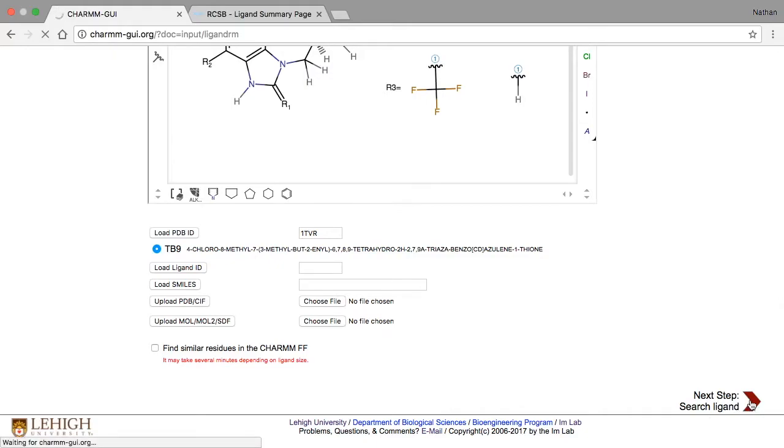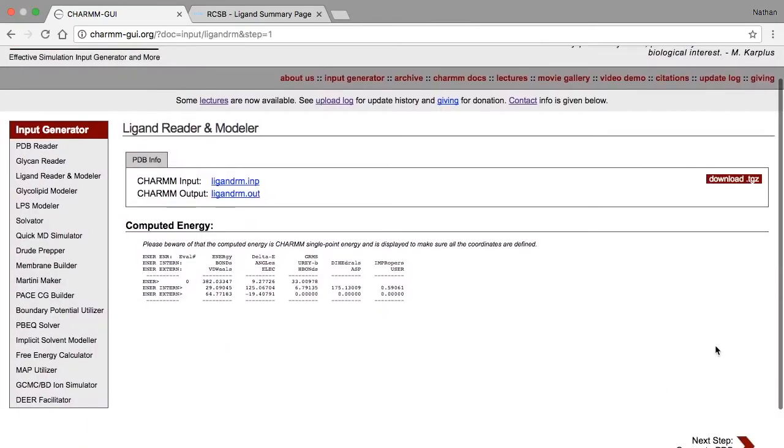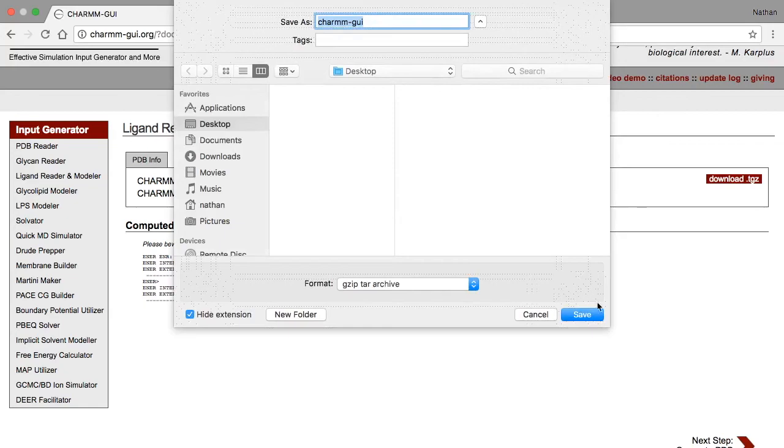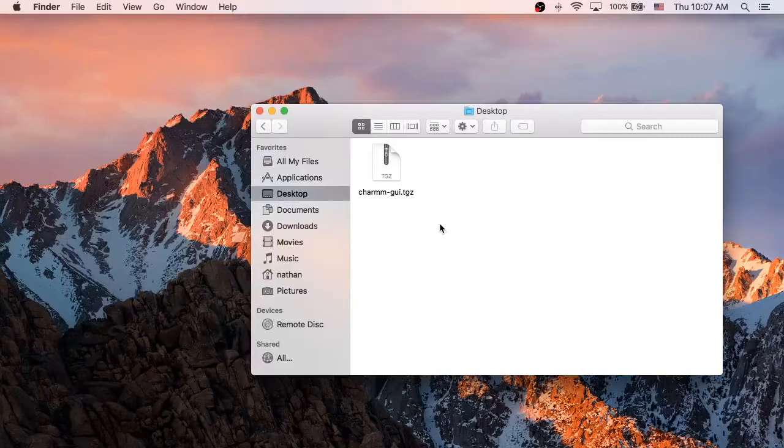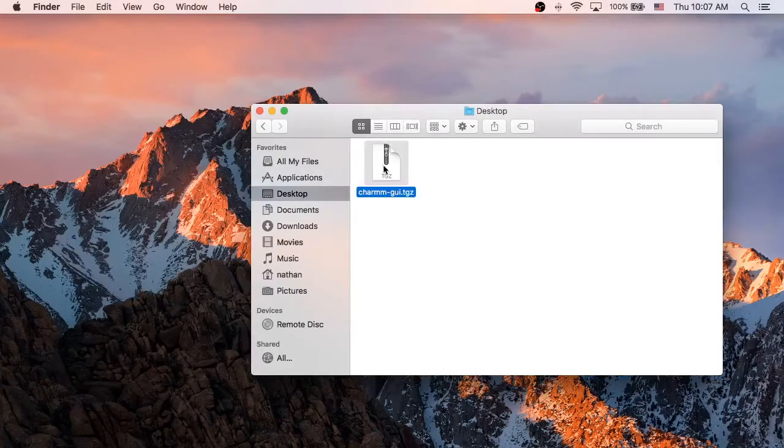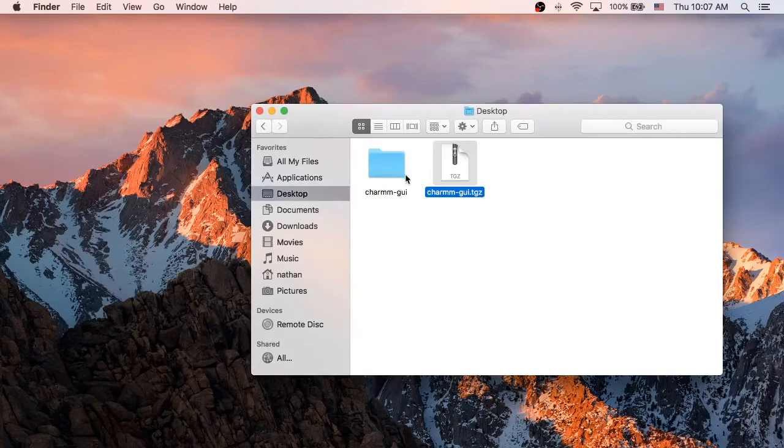Ligand Reader and Modeler will then take care of generating every possible combination of replacements. This should result in 12 structures. Download the results, then extract and open the Charm GUI folder.